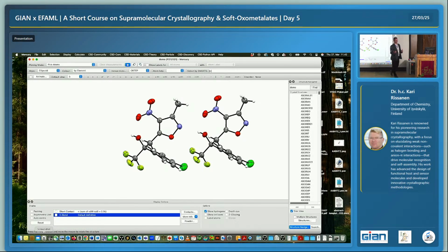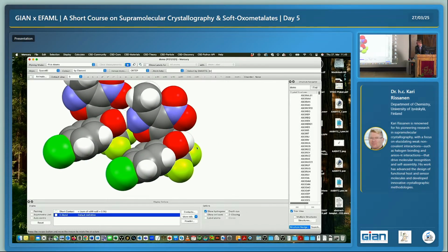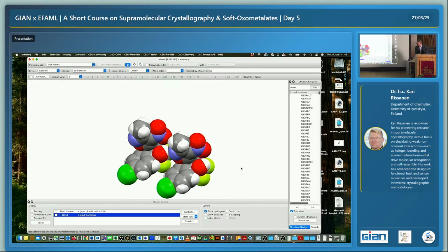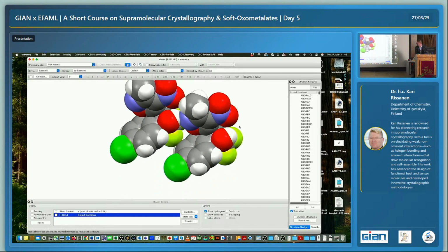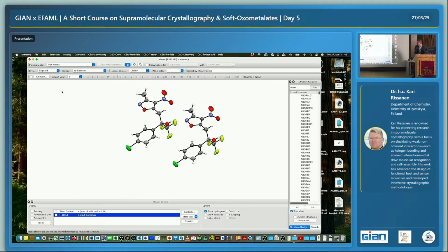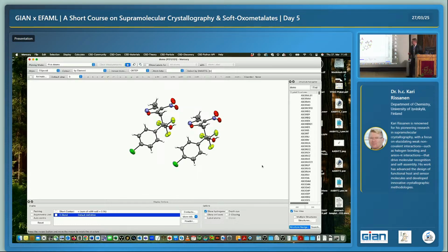So in order to see this nicely, we use the space filling for this. We do this. I click space filling. Now you see, interesting. Now I will change it back. Have a better orientation. Trying like this. Now look at this region. So the hydrogen bond is here.